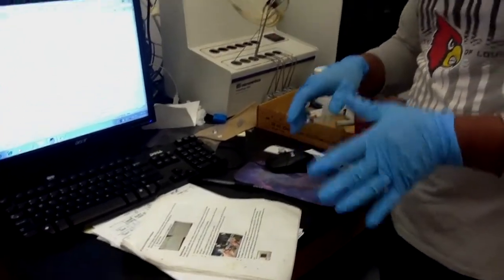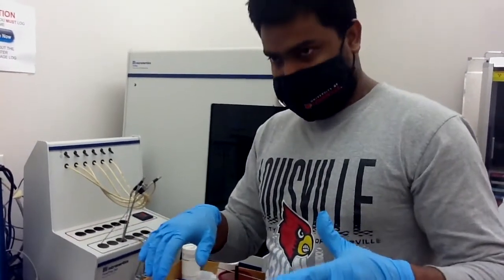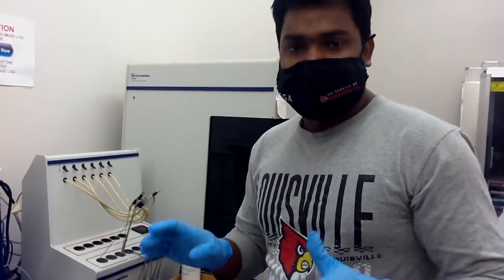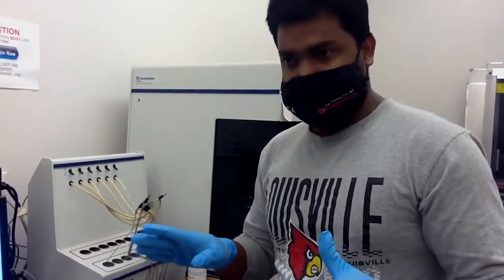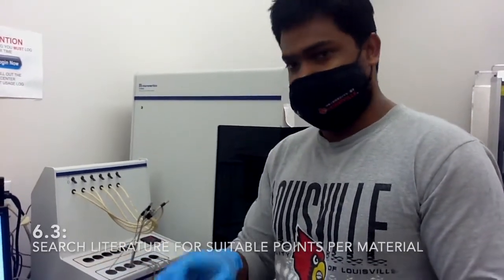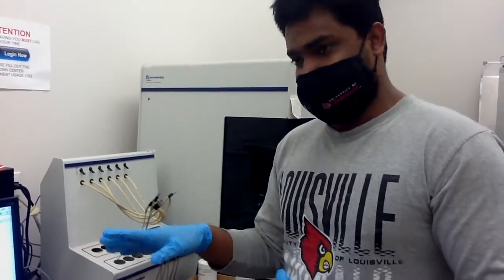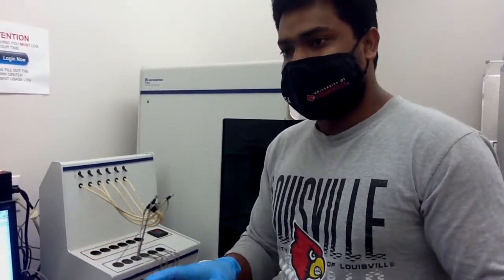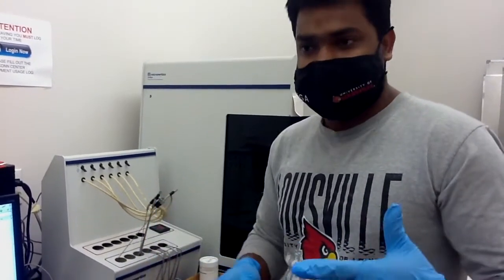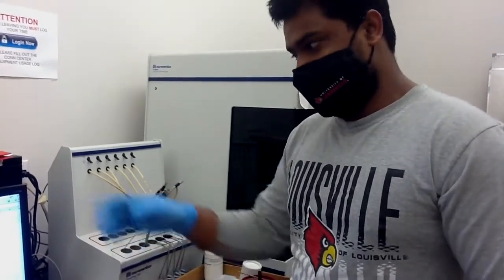So check your literature before starting the materials, like what their pressure range is and what points you want to select for your surface area, also the adsorption and desorption data. Just check the literature and find what suitable points you need, because I put these parameters for my materials. So for your materials it might be different. So just check the reference and check which pressure you need, and then set the parameters and run it. Yeah, that's all.